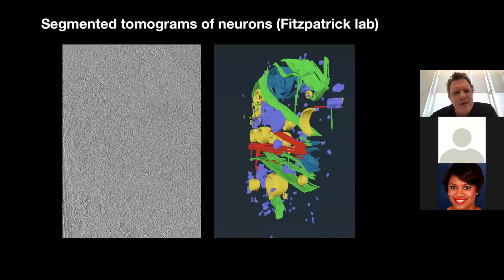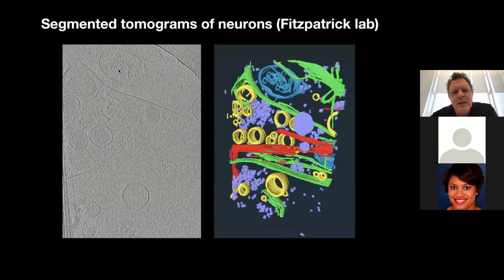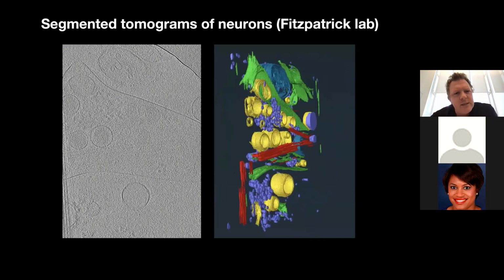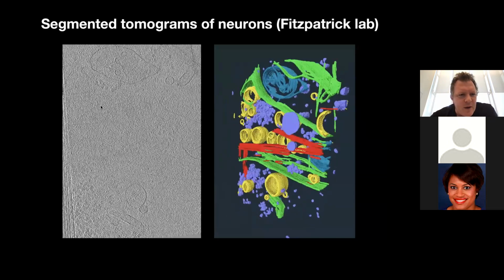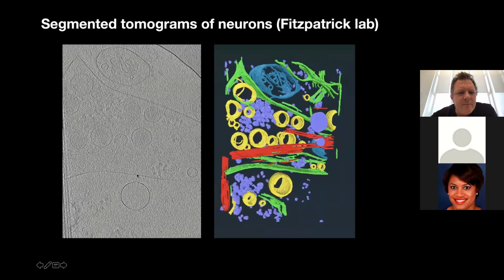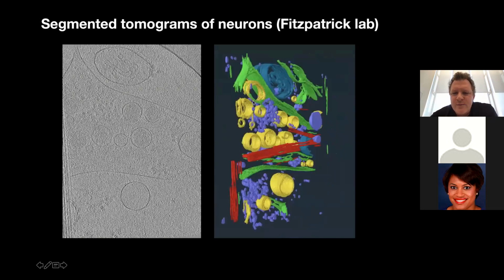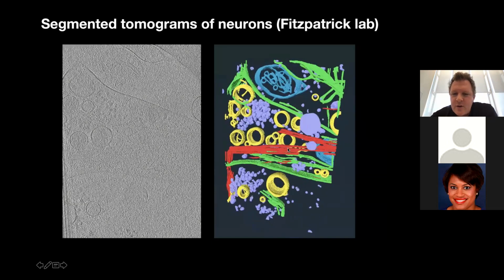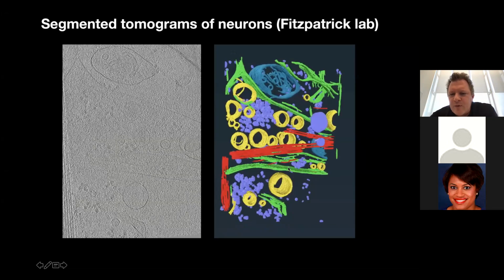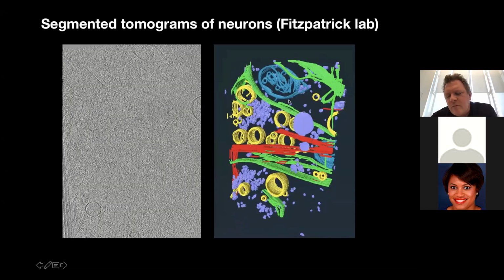These are some results from my lab that we've generated. So what you're seeing here on the left is the tilt series of a stage on which there were neuronal cells. You can see a lot of detail already just by eye. You can kind of see that these are ribosomes. There's some vesicles around, some kind of membranes. And whenever we do the reconstruction of this part of the cell, you can actually see now that indeed there are microtubules, vesicles perhaps being moved along on those. Purple is the ribosomes, and then this green is kind of membrane.